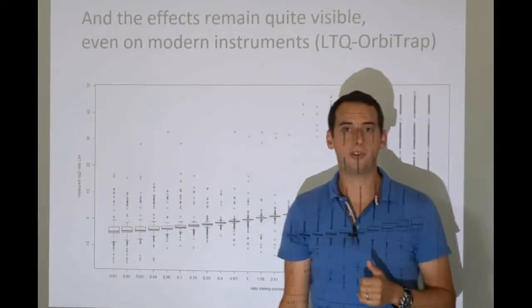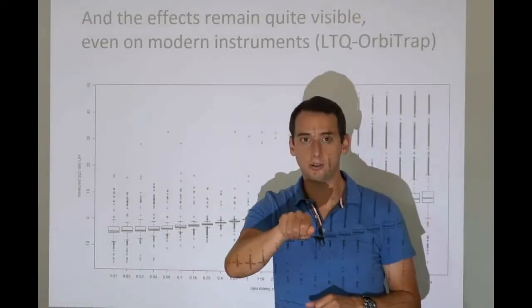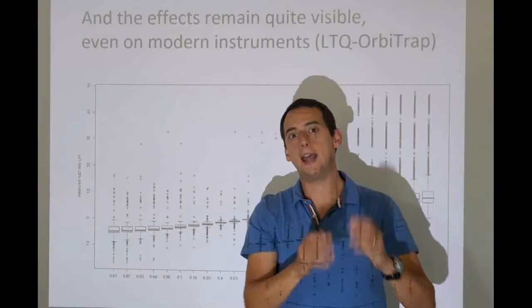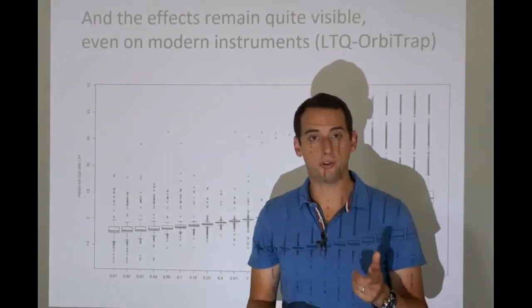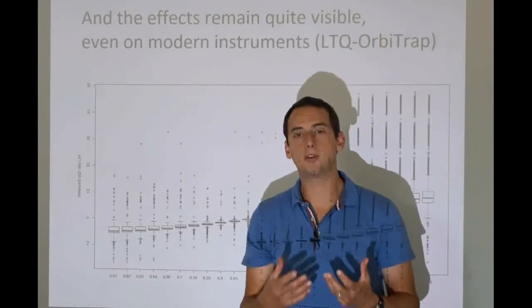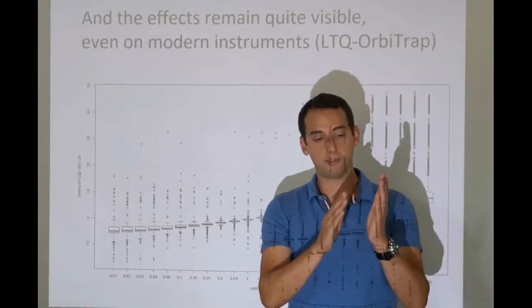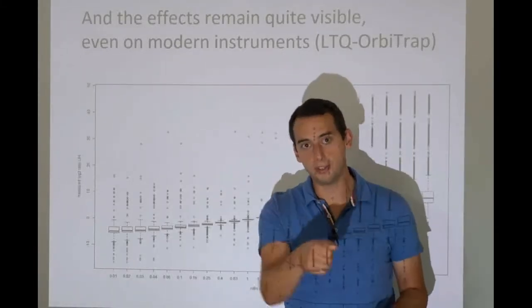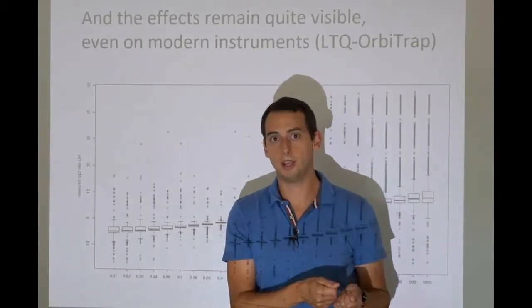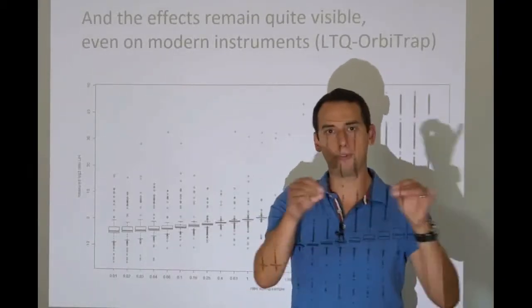So what people do to compensate for that is just like what you would do in the stereo: you just turn up the volume. They essentially continuously add amplification. So they put higher voltages on the plates, and that actually gives a bigger signal. Now the problem is, just like your car stereo, if you turn it up too far, it will start to crackle, and it will start to sound really bad, because you've exceeded the limitations of the device. This happens with the detector too. When it becomes sufficiently depleted, it will no longer be possible to continue to turn up the volume, if you like, the amplification. So at some point you have to replace the detector. And that's literally what happens. They take the old detector out, take it away, hopefully for recycling, and they put in a new one.